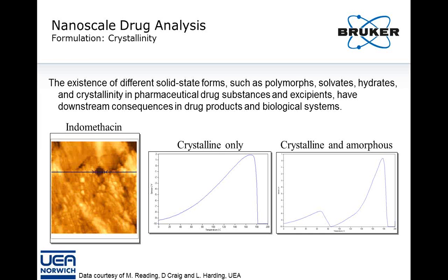Indeed, nanothermal analysis can even find applications in the pharmaceutical areas, where pharmaceutical applications have essentially material problems, such as, for example, in formulation, where mixing of different components as well as their polymers may have an effect on the efficiency of drug delivery, where, for example, in an amorphous formulation, it may be undesired for the material to crystallize and the API to aggregate. We see in this example where a nano-TA curve was recorded at two locations that we can clearly distinguish crystalline from amorphous polymorph.